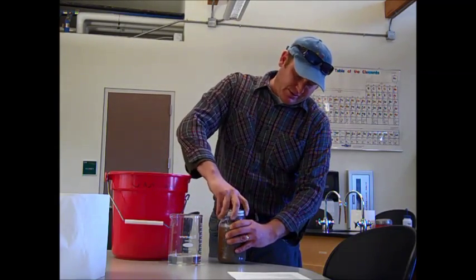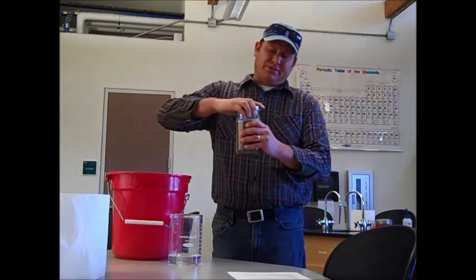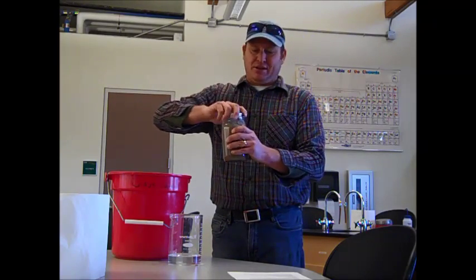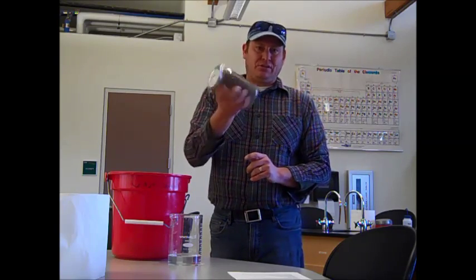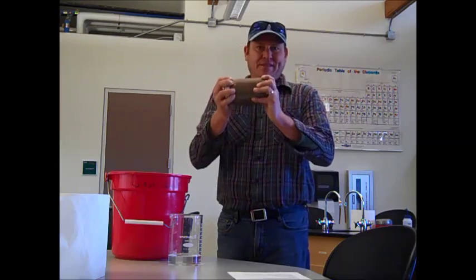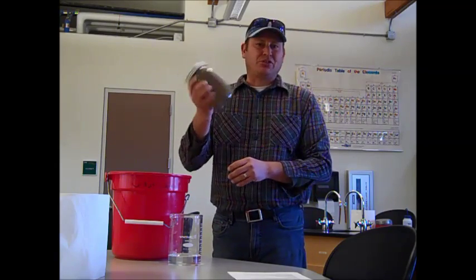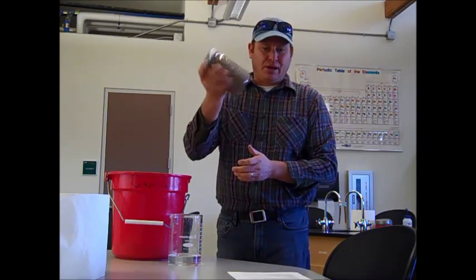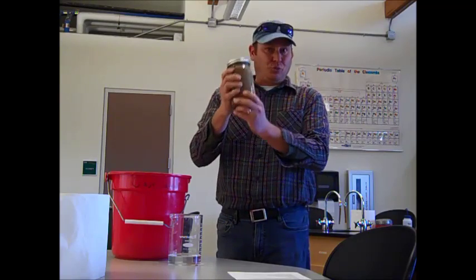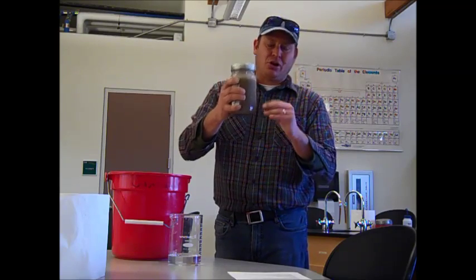I'm putting the lid on there. If I was doing this outside, I could put my hand over it and shake it up. It doesn't need to be a fancy lid. So now I'm making sure all of this gets into suspension. It's like a mixed drink. Okay, it's all in suspension, it's all stirred up. Now I'm going to sit this. This is why we start with this one. I'm going to sit it, leave it somewhere, don't touch it, let sedimentation occur.